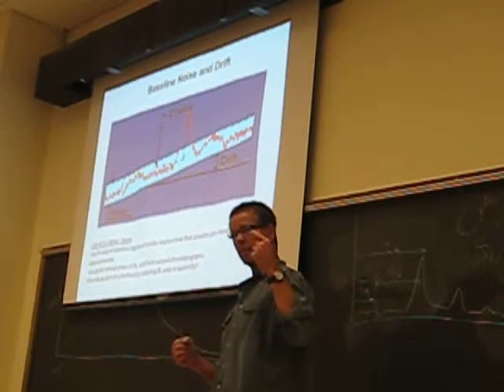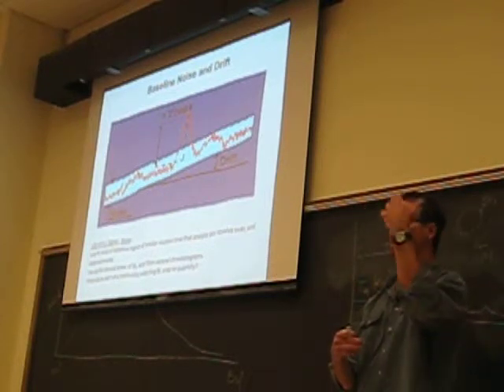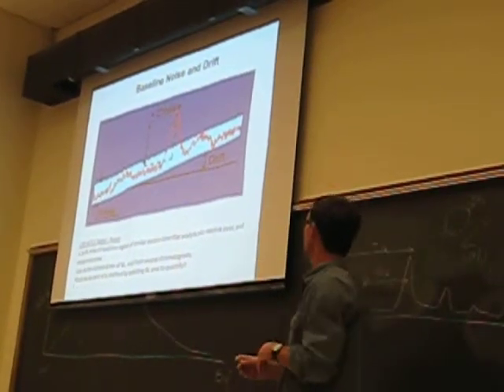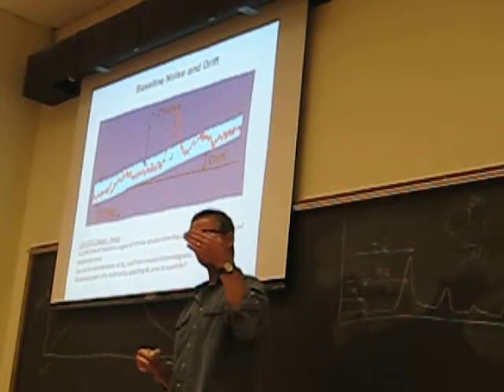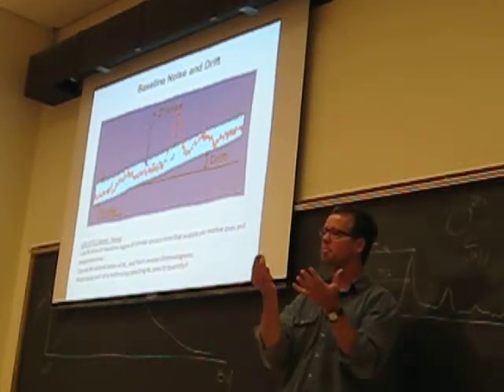When that thing that we're trying to detect hits the detector, it generates some type of response. Typically, the kicking off of electrons that would generate a cascade and ultimately a potential we can measure. We'll talk much more about that. It's the detector that is essentially the source of the noise. The instrument is incurring noise into our measurement, right?